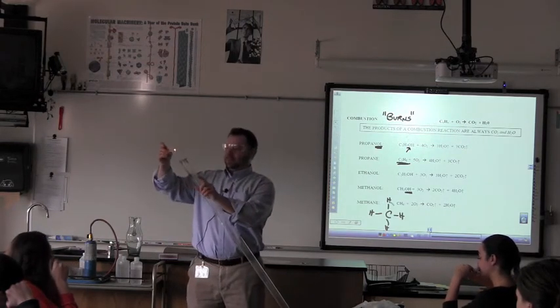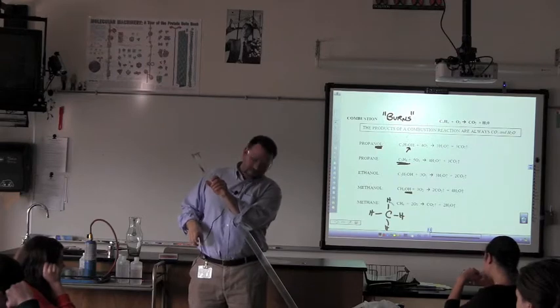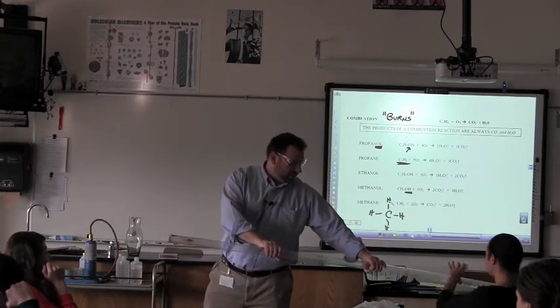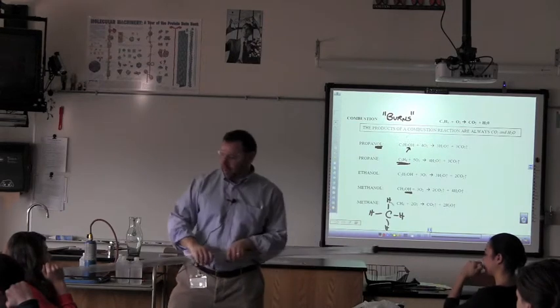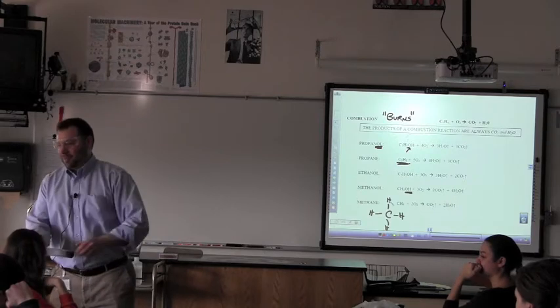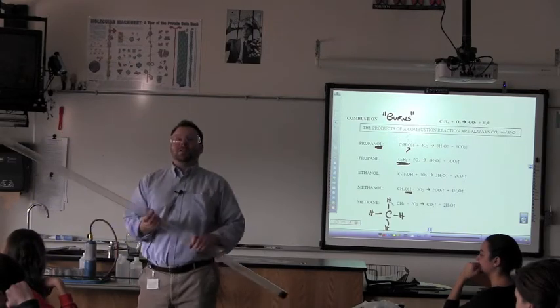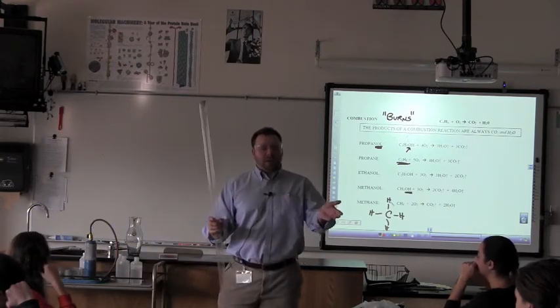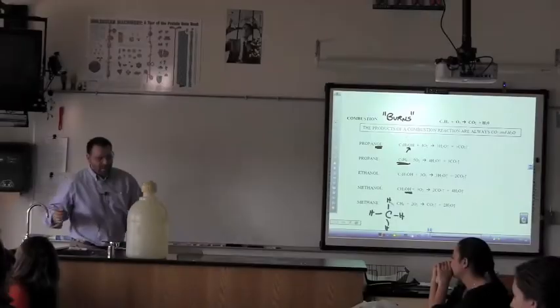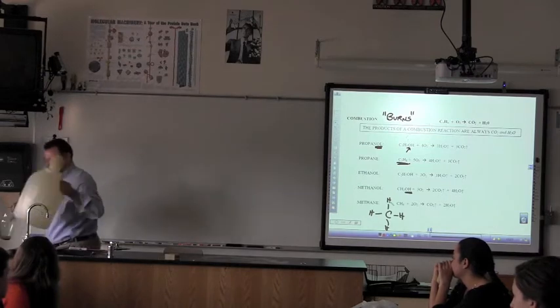So here we go. Not as spectacular again, but one thing I want you to do, feel that. It's warm. Definitely warm? Yeah, you gotta participate here. There we go. Yeah, definitely you can feel the heat there. As we'd predict, we should have the light and the heat. The sound is an artifact of how the tube is shaped. So, the piece de resistance, the favorite of combustion day.